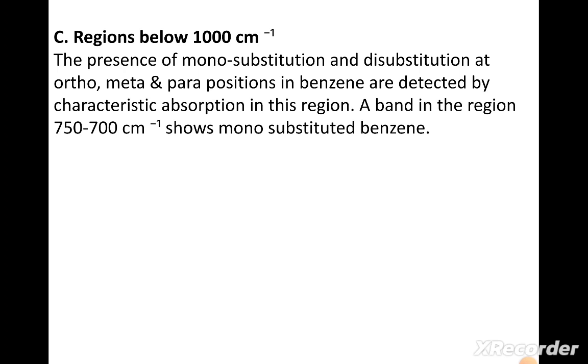So in this video we have studied the general introduction of IR spectroscopy, and then we have studied Fermi resonance and then the fingerprint region. These are important topics of IR spectroscopy.